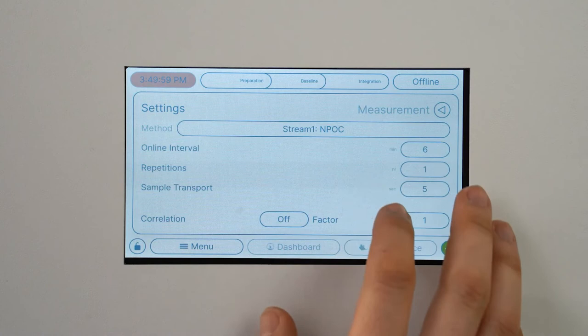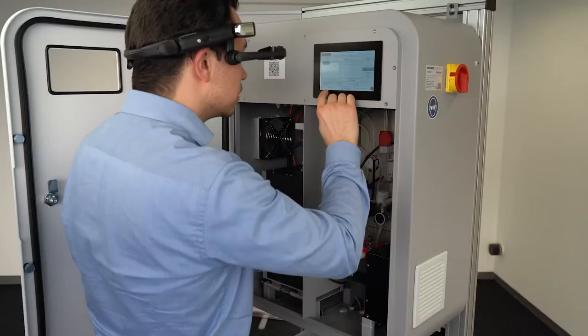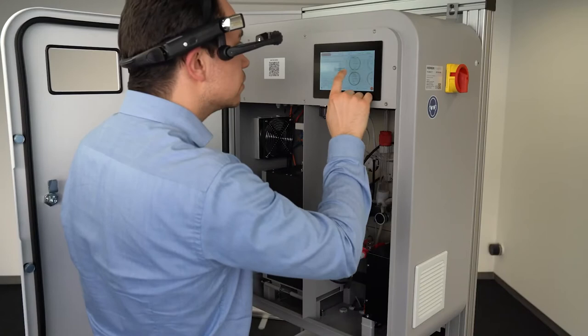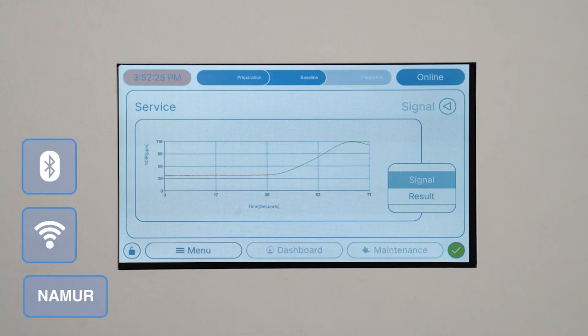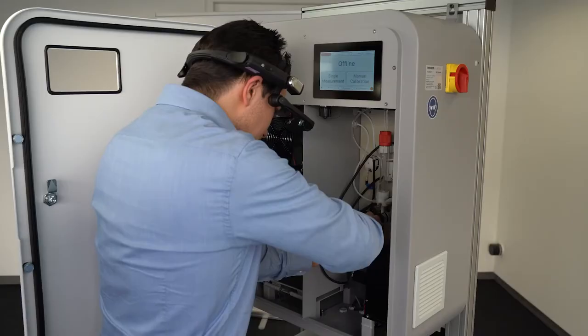The modern, intuitively operable touch panel provides the measurement and status information in a self-explaining and user-friendly manner. Extensive IIoT features such as predictive maintenance as well as state-of-the-art communication tools are available.